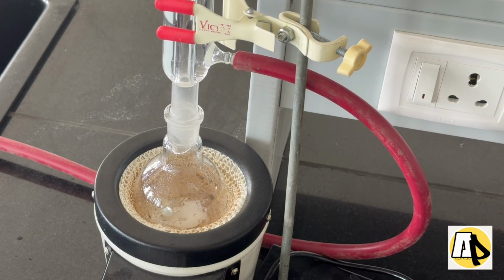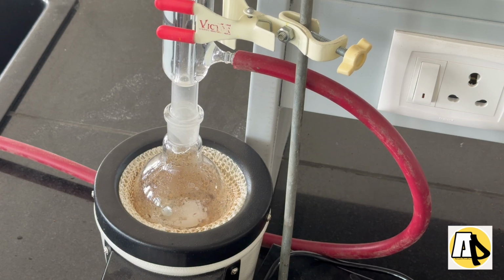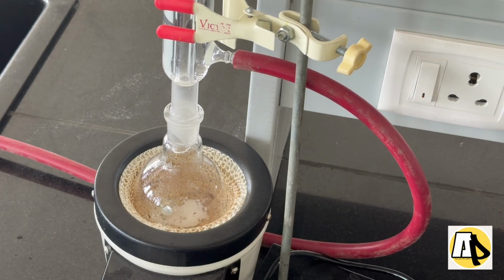That means the reaction is completed and sodium salt of salicylic acid is already formed. And since the solution is hot and 10% sodium hydroxide also contains water, the sodium salt of salicylic acid is completely miscible in that when it is hot. After that we are going to put it in cold water to cool it and then acidify with HCl, and then we can see salicylic acid.